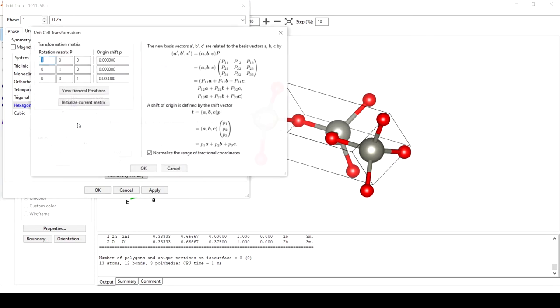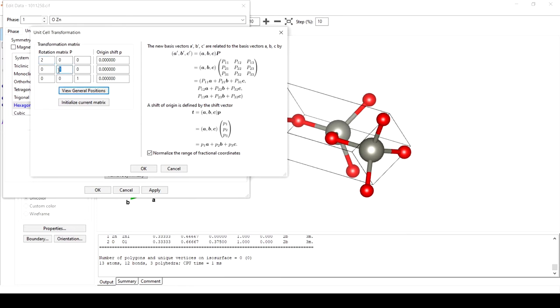To transform the unit cell to have a 2x2x2 supercell, we will just transform this rotation matrix by replacing 1 with 2.